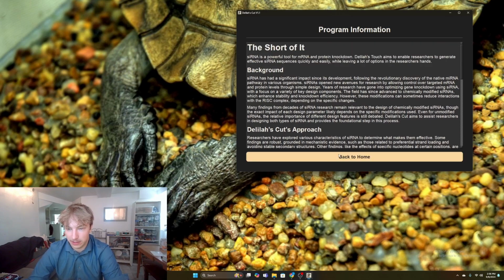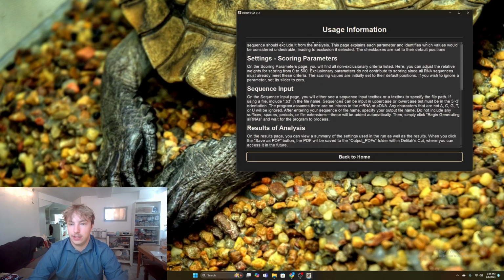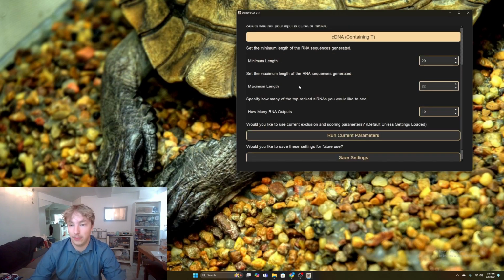This is the intro page, and here you can see information about it, which is a lot more detail than we need to go into in this video, and why this program is useful and what research it is based on. And then usage, this goes into stuff that we'll go into in this video. And then begin analysis.